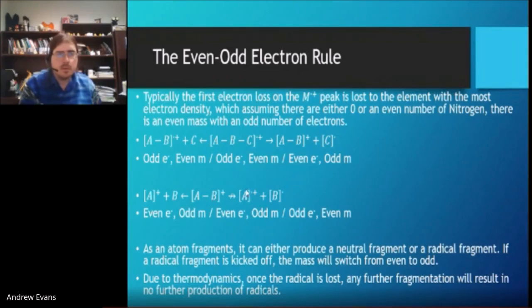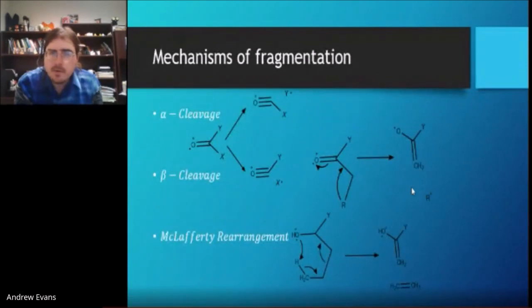So, depending on how this fragments, basically, usually we're going to see a flip-flop, that we're going to see various different fragmentations, usually in some sort of stable compound.